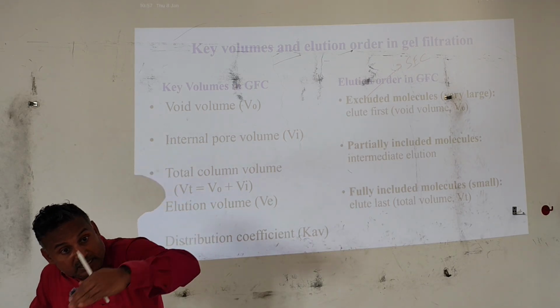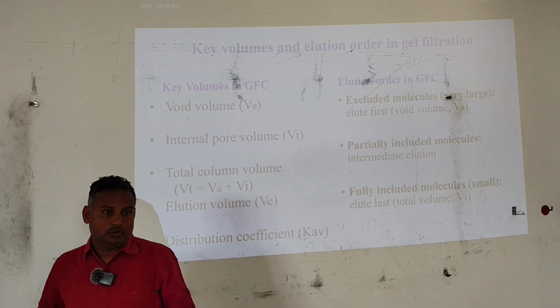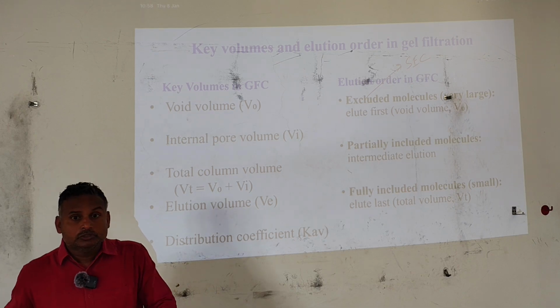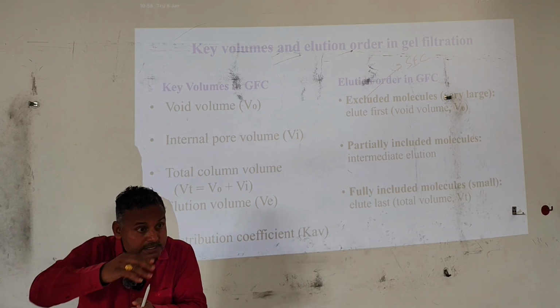Excluded from entering inside the pores. With respect to this, we call the technique SEC. With respect to the smaller molecules, they will permeate inside. Permeate means they will penetrate inside the pores.